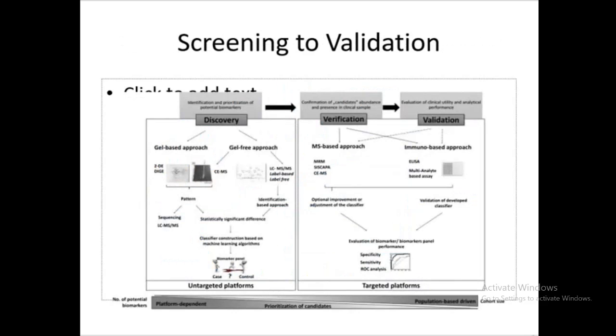If you wanted to do the same sort of approach looking at proteins or other molecules of interest, you could have discovery using gel-based or gel-free based methods. That's essentially where you separate a whole range of components.